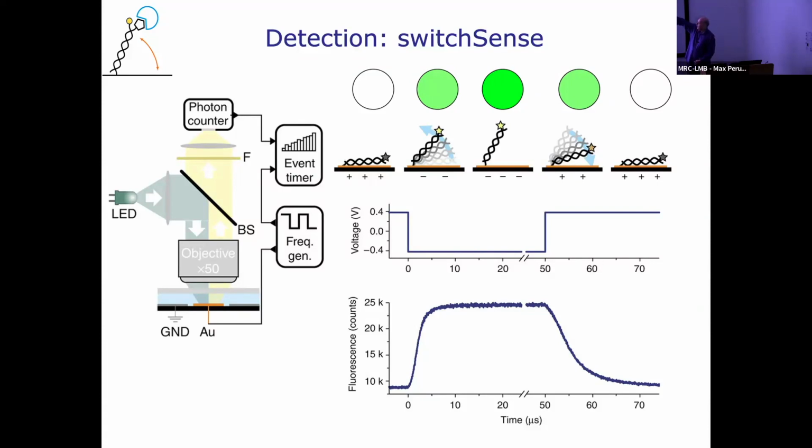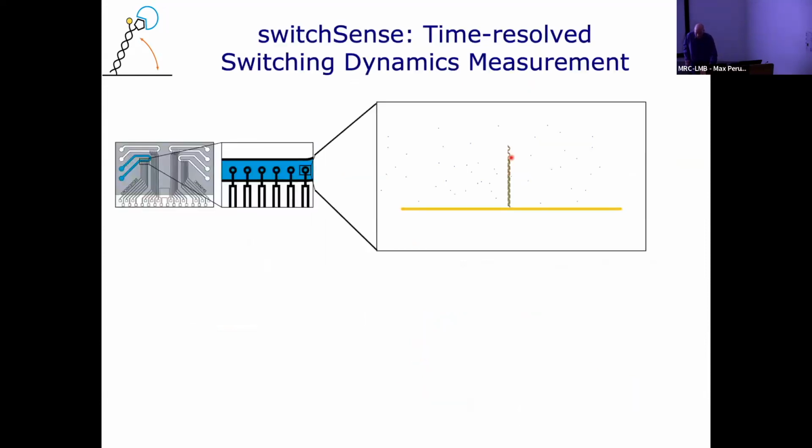So when it's positive, the nanolever is then attracted to the gold surface. That quenches the fluorescence. Then you reverse the charge. Then the nanolever starts to float up, and then the fluorescence increases. So you're getting then this alternating current, and you can see then the change in the fluorescence in the microsecond time frame. And here's kind of a movie of what's going to actually happen.